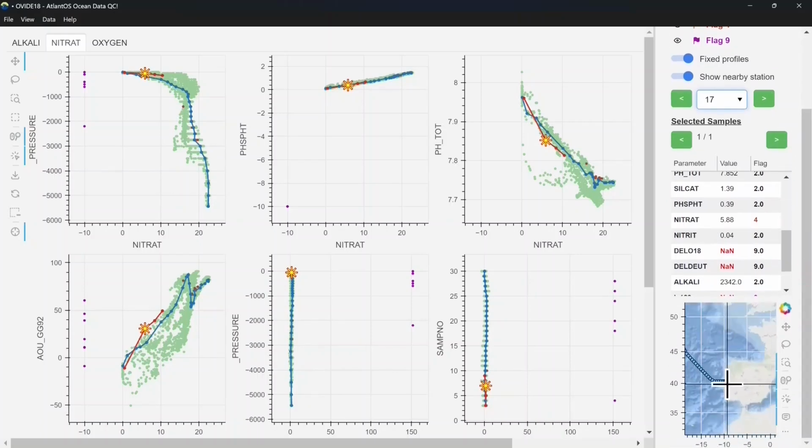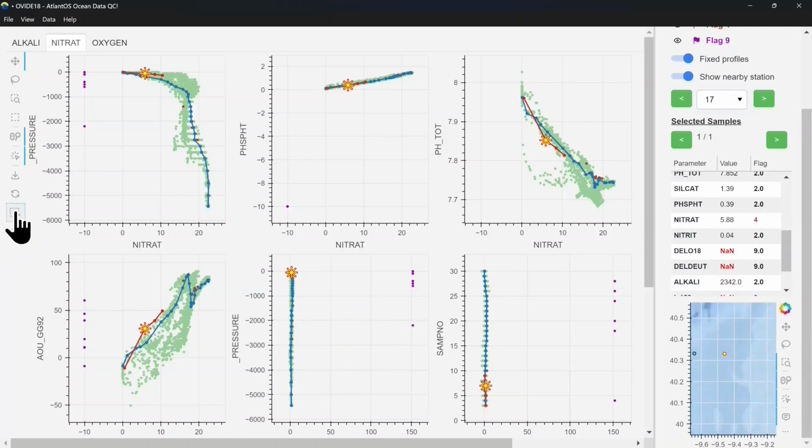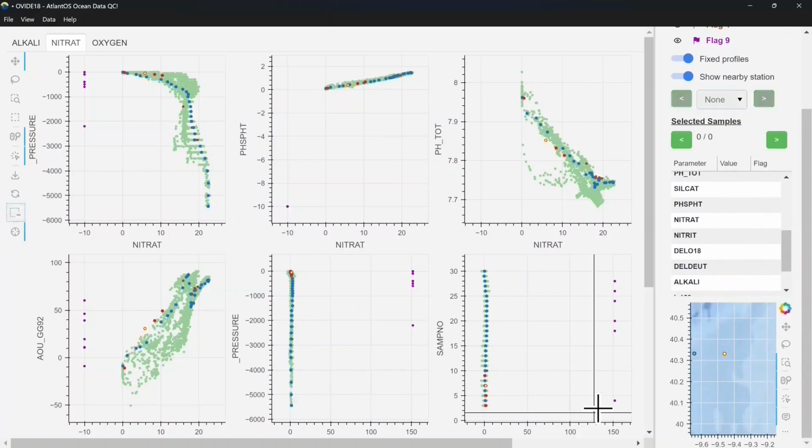The flag values for a simple sample can also be updated directly in the data table by double-clicking over the flag value. In the next example, CTD SAL flag have been double-clicked and its value has been changed.